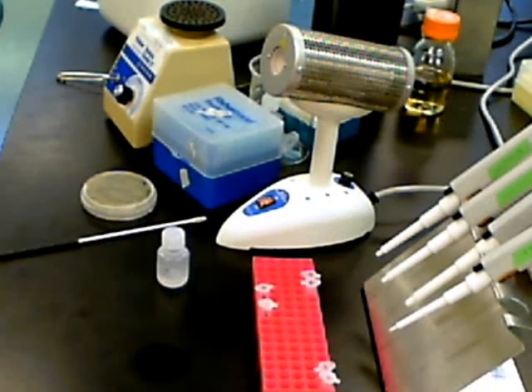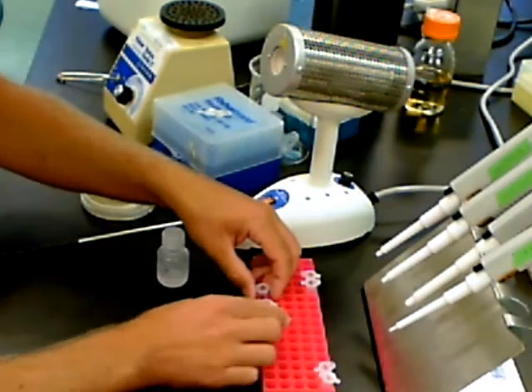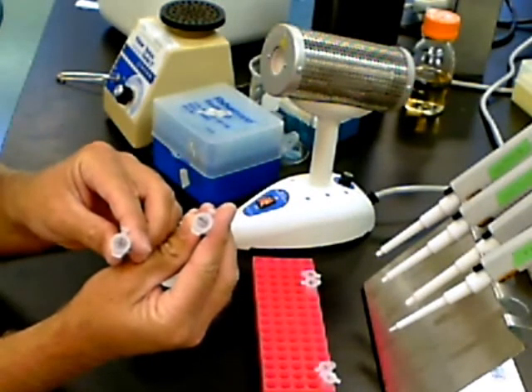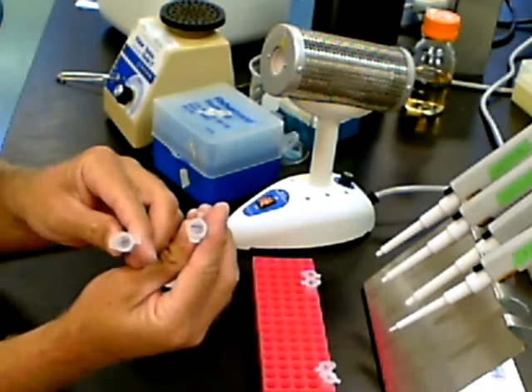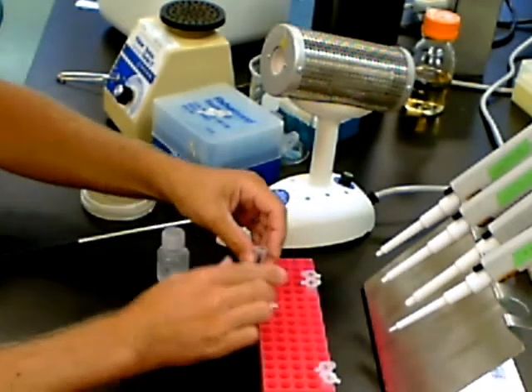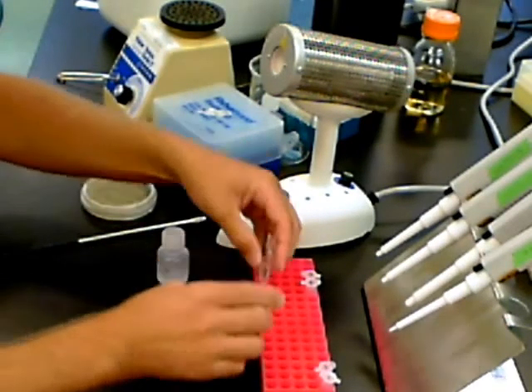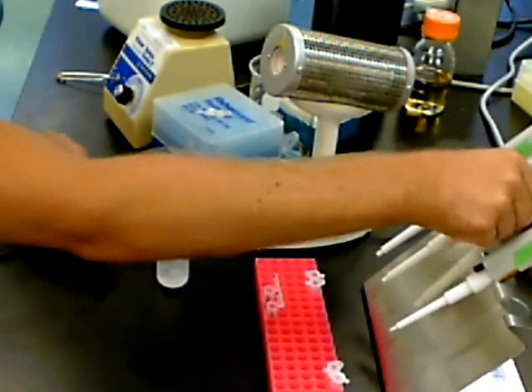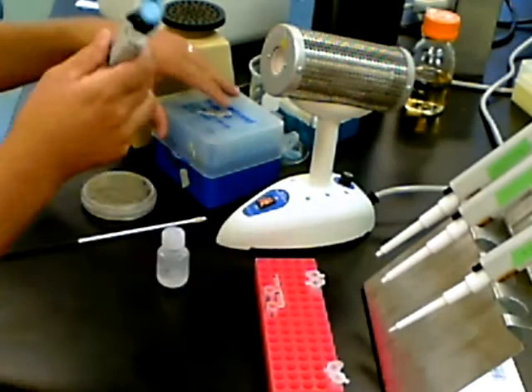To begin with, we need to label two microfuge tubes, one with a plus sign and one with a minus sign. The plus sign indicates that that's the tube we're putting DNA in, and the minus sign means we'll not be putting DNA in this tube. That will be the control tube, and the plus DNA tube will be our experimental tube.